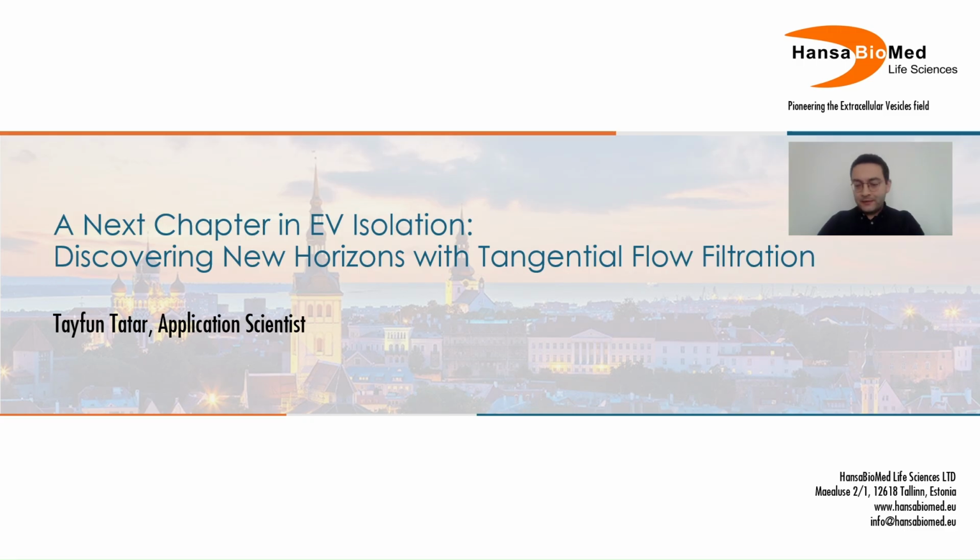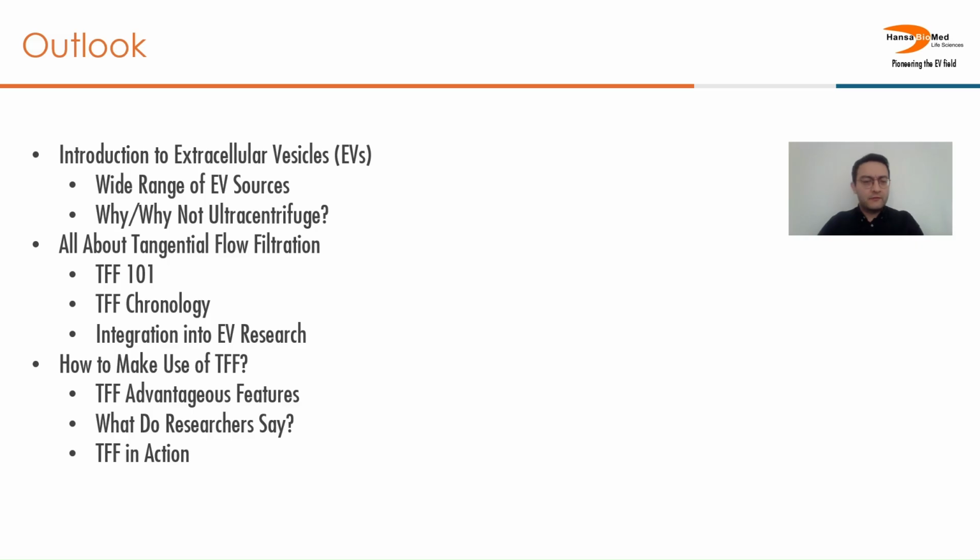But here I am. So today I would like to talk about a next chapter in EV isolation through tangential flow filtration, one of the novel approaches. During my presentation, I will first start with an introduction into extracellular vesicles, but I will keep this short because I'm aware that I'm already speaking to an EV-focused audience, so you know much better than me. But I will continue with the isolation aspect of EV research, and I will start with why and why not ultracentrifuge, speaking of its advantages and disadvantages.